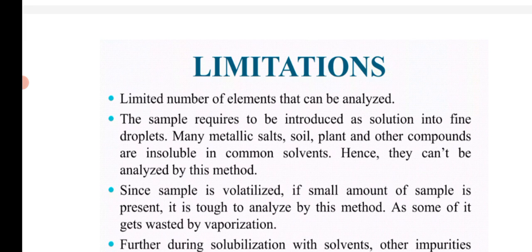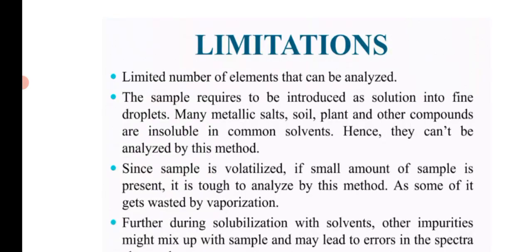Many metallic salts, soil, plants and other compounds are insoluble in common solvents. Hence, they cannot be analyzed by this method. Since the sample is volatilized, if a small amount of sample is present, it is tough to analyze by this method, as some of it gets wasted by vaporization.